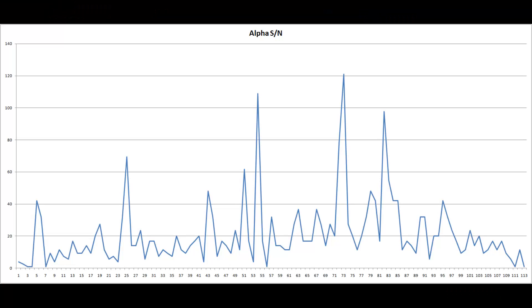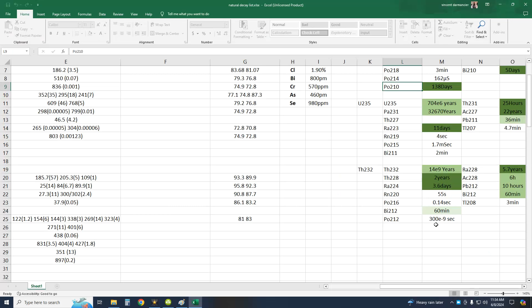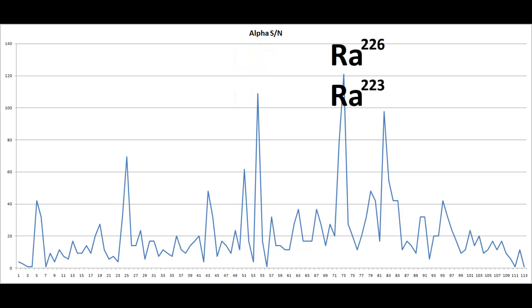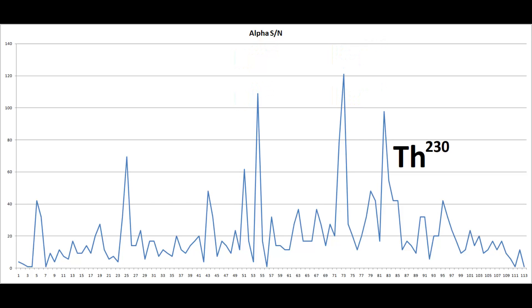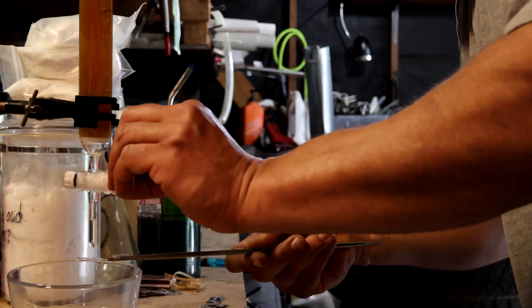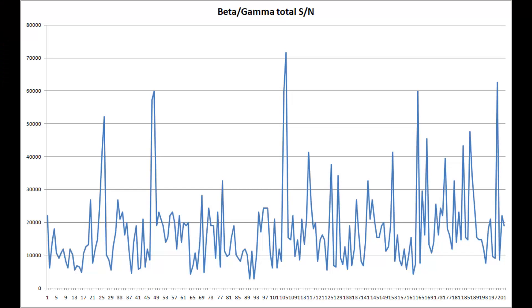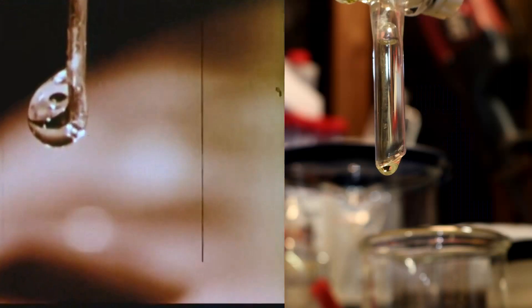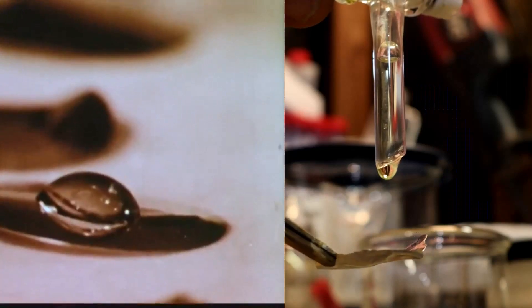So here is what I got for the total alpha. Based on the activity present, the mode of decay, the elution behavior, and likely oxidation state, I believe this is polonium-210, uranium-238 and uranium-234 here, radium-226 and uranium-235 here, and finally thorium-230 here, with maybe some protactinium-231 down here — but this could be nothing. I cannot prove any of it and these are just guesses on my part, but it makes sense to me.